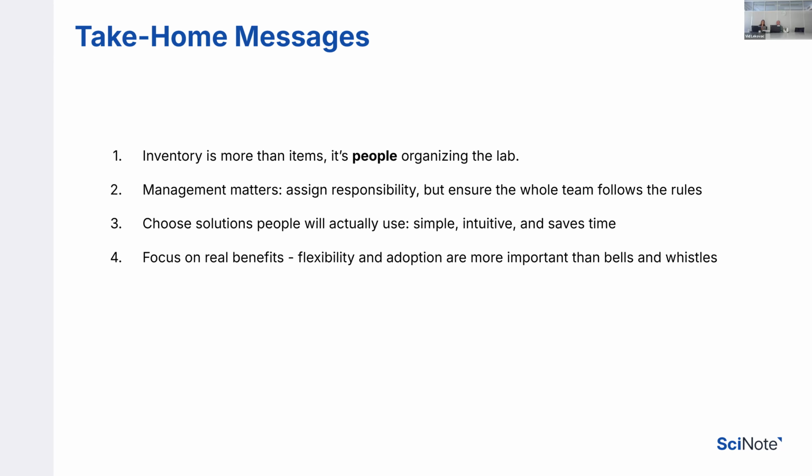From my side, where I'm obviously dealing with the customers, a lot of times I see that there is a problem with user adoption because sometimes decision makers are making a decision for something without involving other users. So when you are selecting whichever solution, please do involve people that will actually be using, in this case, inventories. Usually those people will be looking for something that is user friendly, time efficient for them, and that will seamlessly integrate into their daily routine.